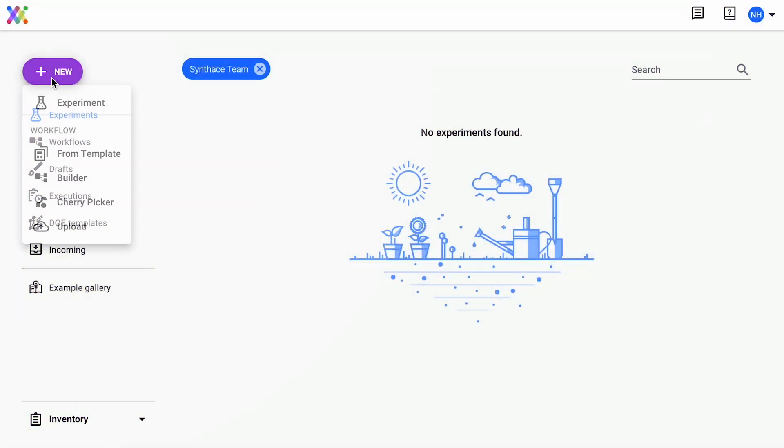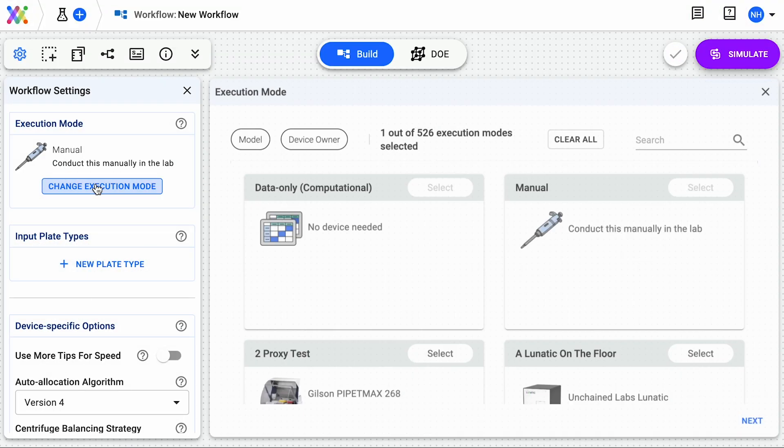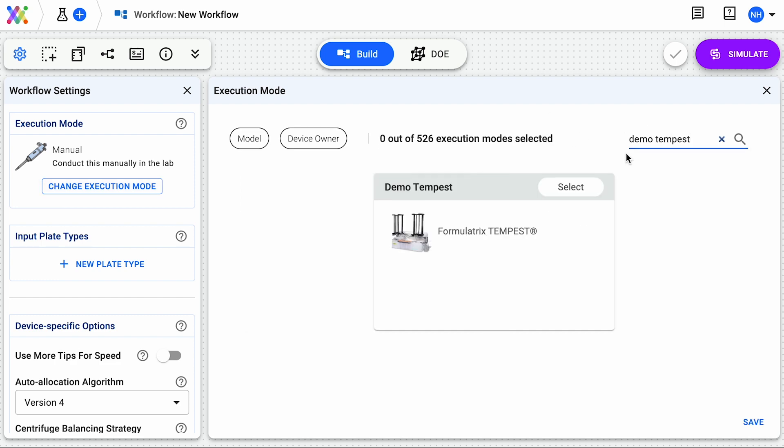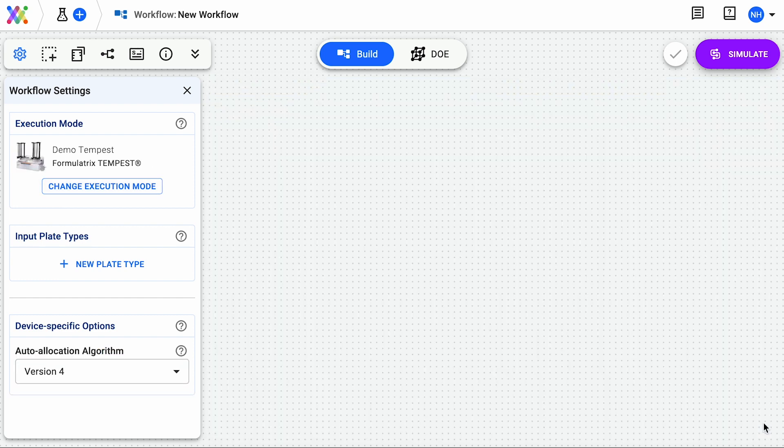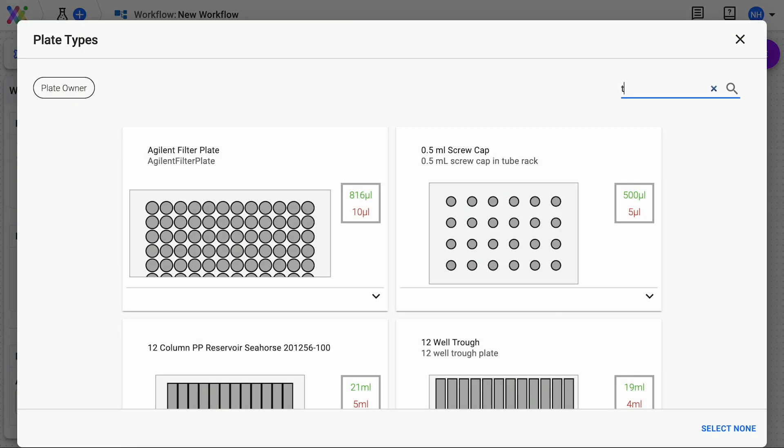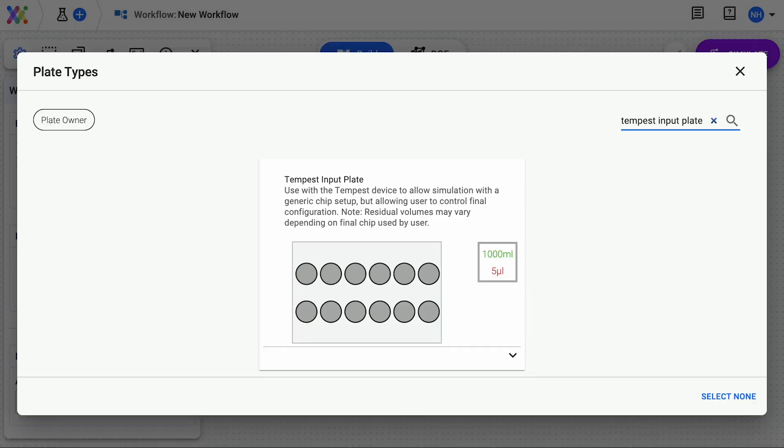First, make a workflow in Synthase. Choose Tempest as the execution mode, and select Tempest Input Plate as the input plate.